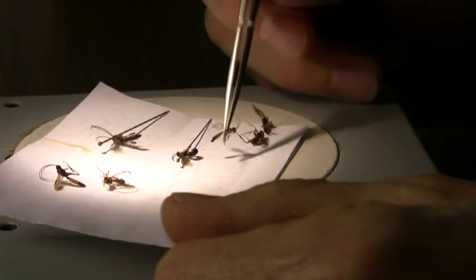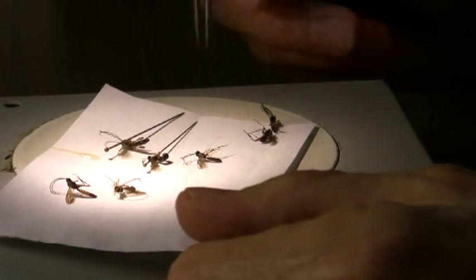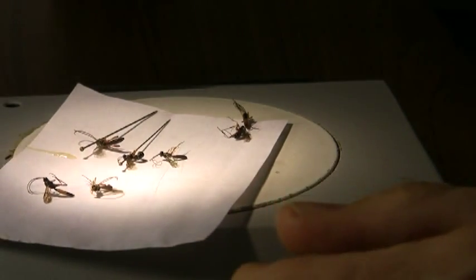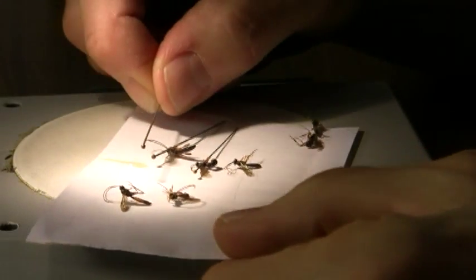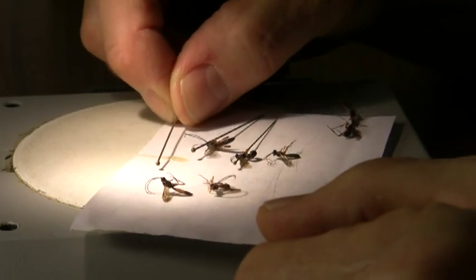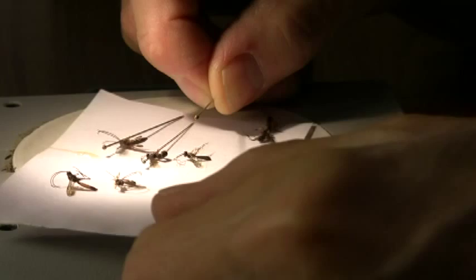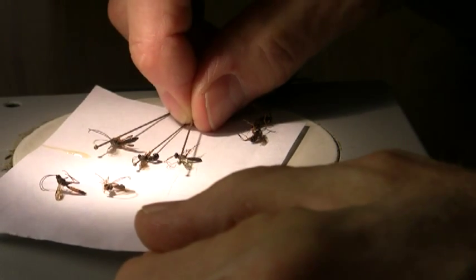Okay, and I'll do one more just to show you how easy this is. And again, it's very quick. That's one other reason for doing this. Again, it doesn't break the specimens, and especially for ichneumonids, it works very, very well. Okay, one last one. We're just going to touch the glue here under the microscope at about the right height, move it over to the specimen, and then set it down on the specimen.